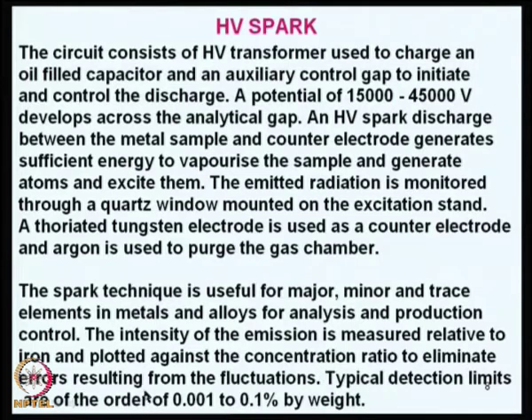Typical detection limits in this case also are of the order of 0.001 to 0.1% by weight. That means it is not a trace technique as such, but it is a very fast tool for you to monitor the quality of the melt in the foundries.